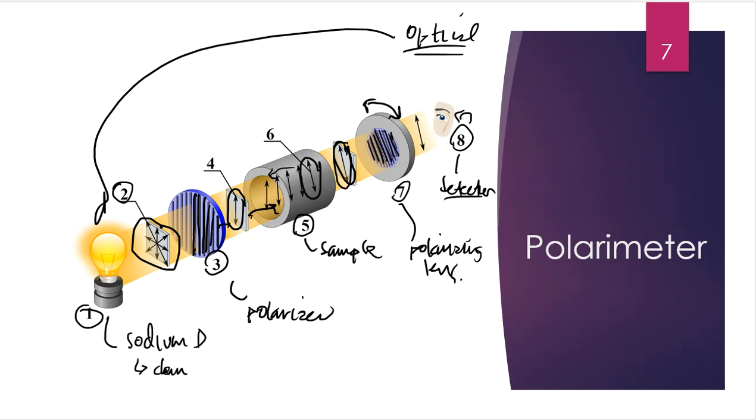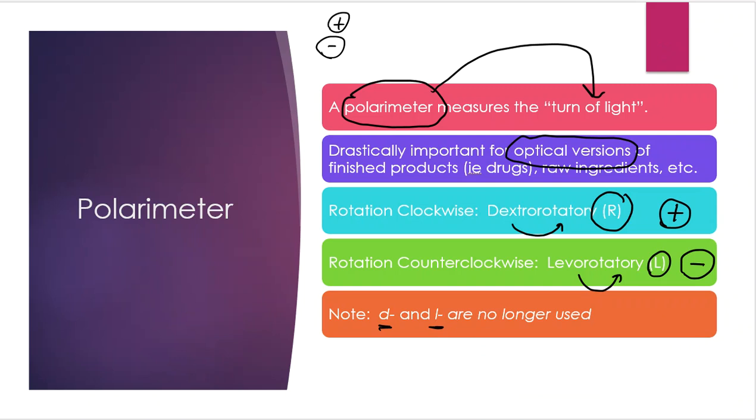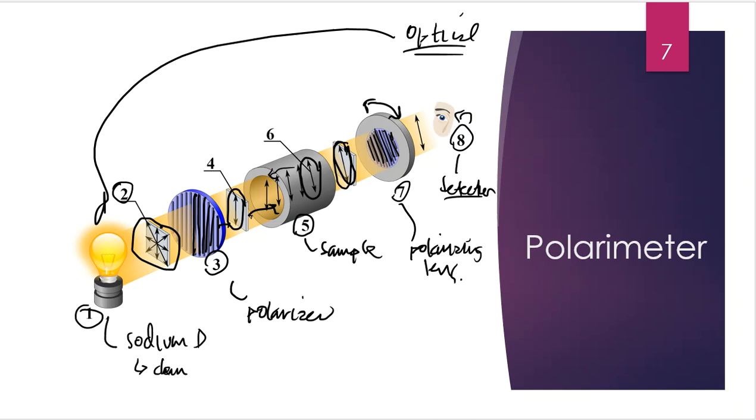end. So when I align those up the proper way, what's going to happen here is that light will go through the polarizing lens, which is the second lens that's turnable, and we see that light escaping through because the entire polarimeter now, if I look through it, begins to light up. If this polarizing lens at the back end was straight up and straight down, the light cannot escape through. And that's because the orientation of that light is hitting the lens that is not allowing it to escape because it can't get through the slots. It can't get through that filter.